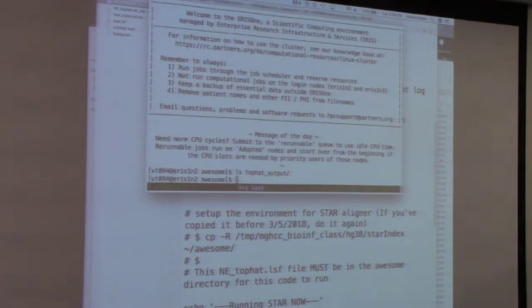Okay? And actually, before you do that, I'm going to do screen. Have you done screen? Okay, so now I'm going to do bsub -q normal, and you pass the file test.lsf. Okay. It's running somewhere. So did it submit it? Now it's good. It's going to take some time.